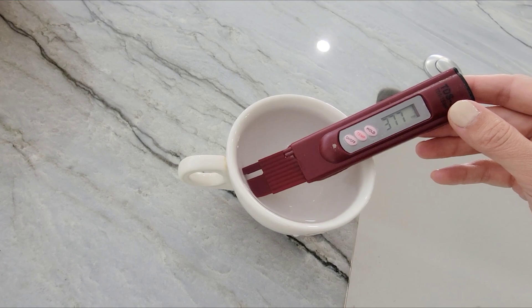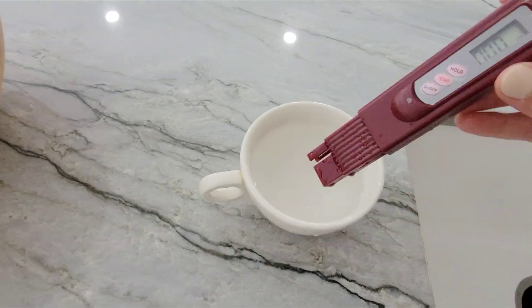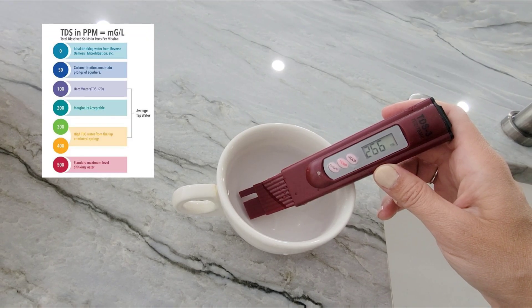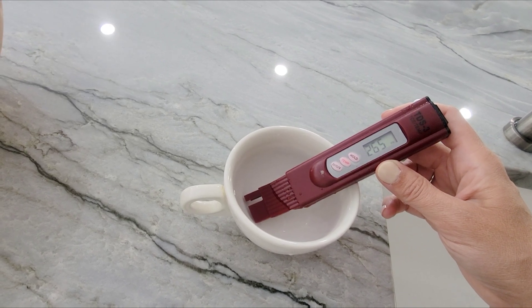Now let's look at the filtered water. Let's set this in here. Down by 100. That's so neat — what a big difference. That's awesome.